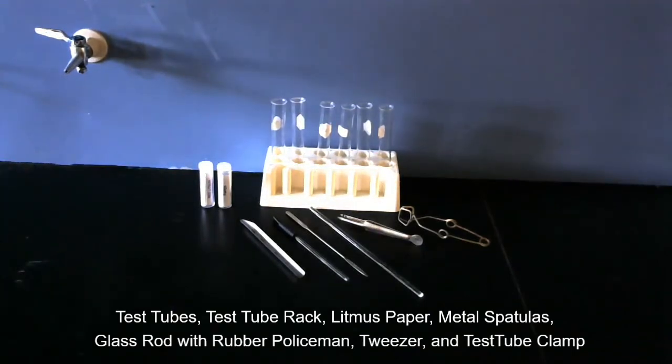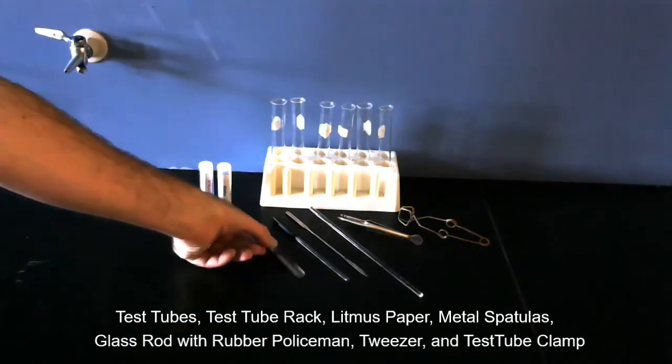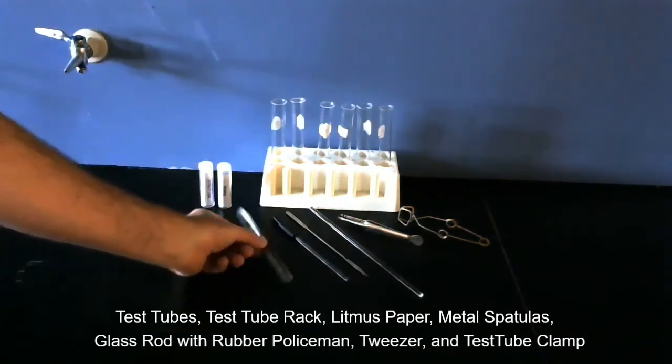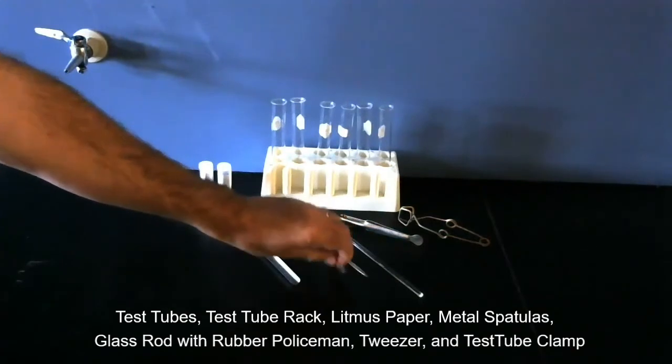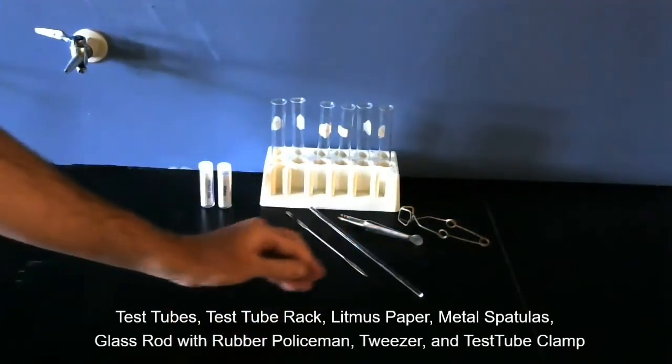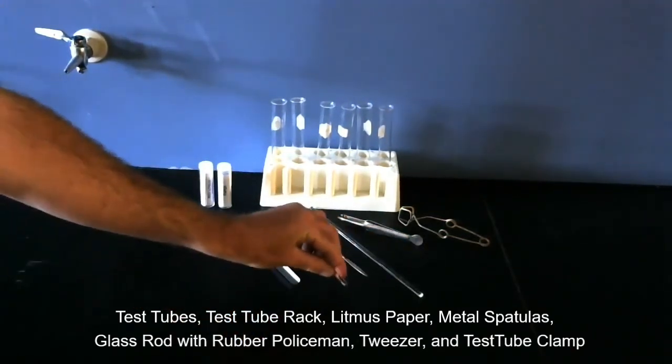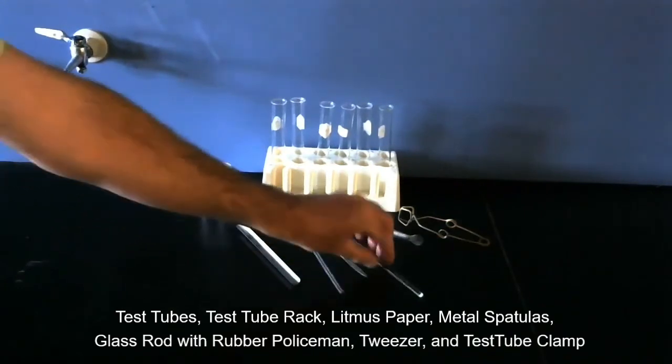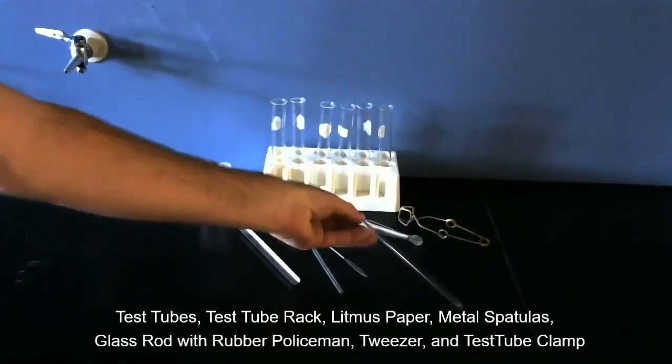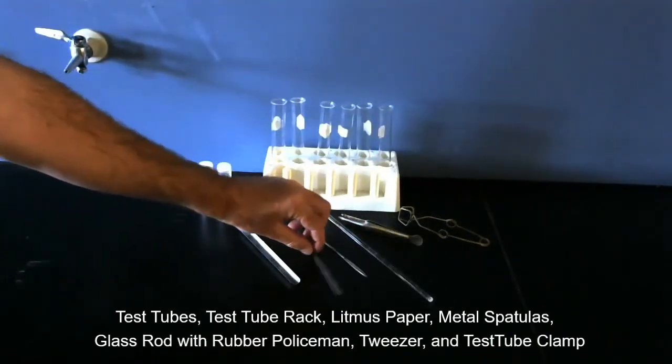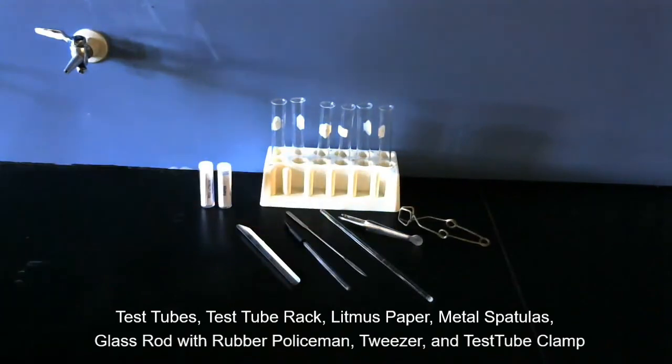This is a metal spatula used for scooping out solids. Here's a glass stirring rod with a rubber tip. They call that a rubber policeman. And here's a glass rod without that on it. The rubber policeman is for getting solids out and scraping them out.